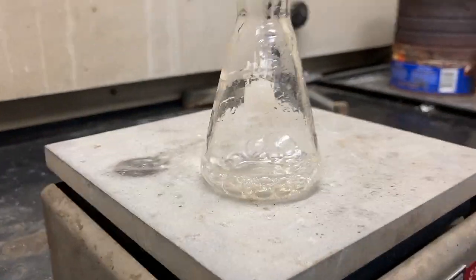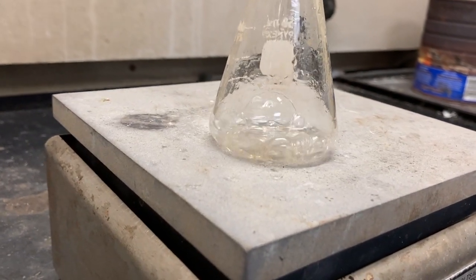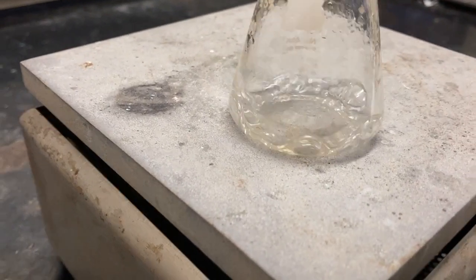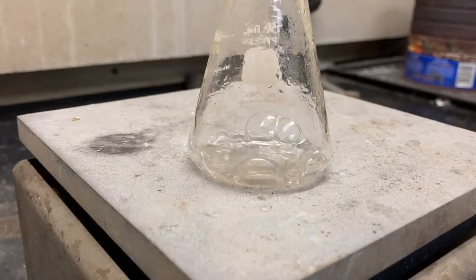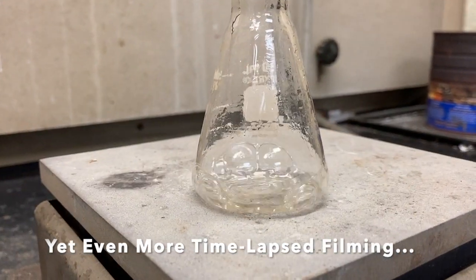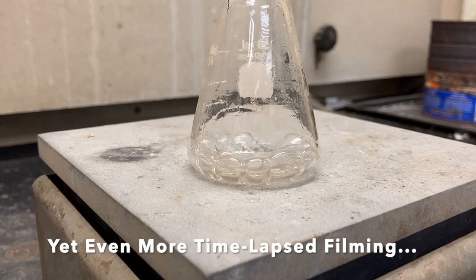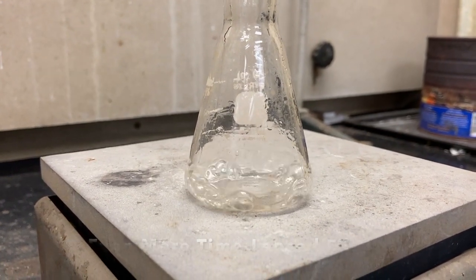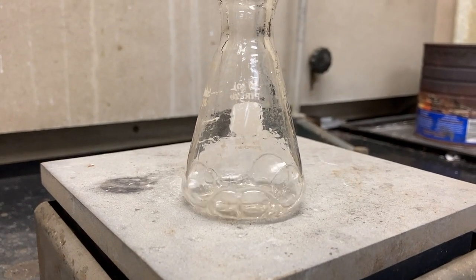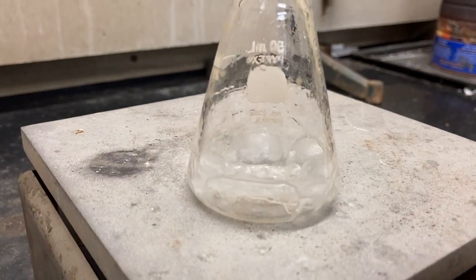So right now, all the magnesium and chloride ions are still dissolved in the little bit of liquid that's left. Right. I see some changes.